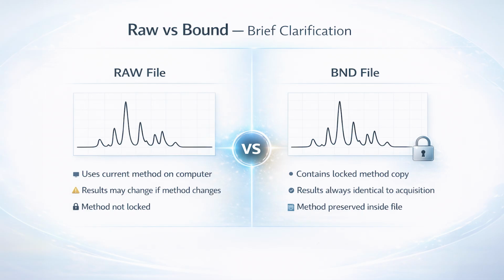At this stage in the training, you do not need to fully understand this distinction. We will explore it in detail in the next phase. For now, opening either file confirms successful acquisition.